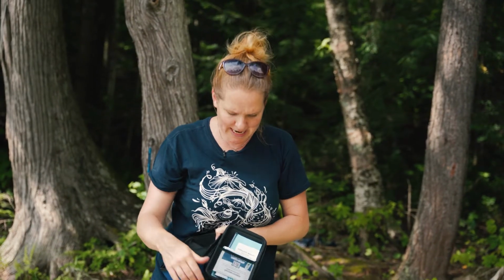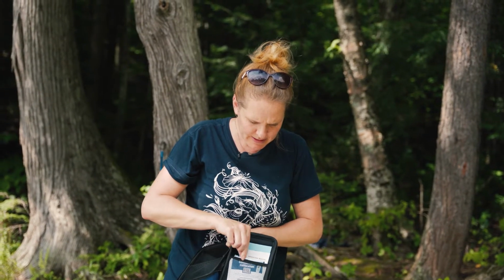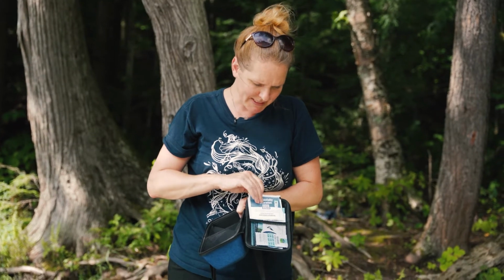Also in your test kit, we include some calibration solution for your conductivity meter. There's directions and a video on how to do that on our website, and you're going to want to do that before your next testing season. When you first get your test kit, we've already calibrated your equipment, so you're ready to go. But once you're using this for a year, you'll want to calibrate it before your next season.